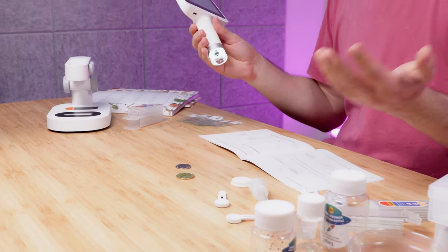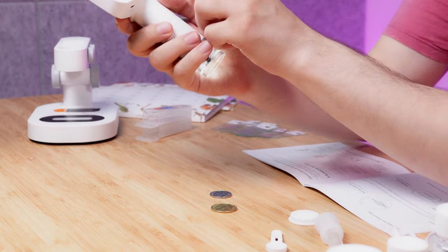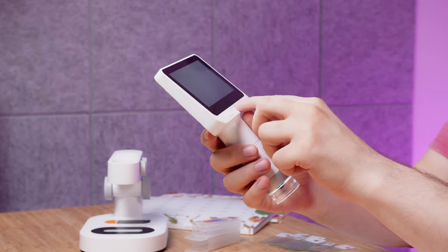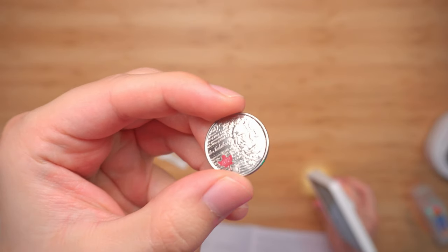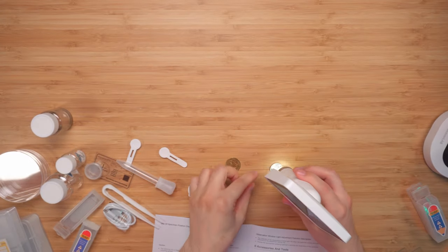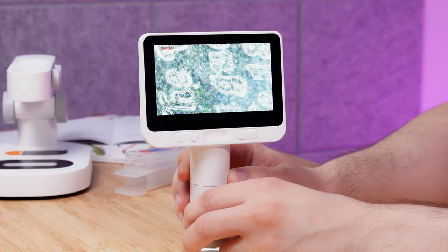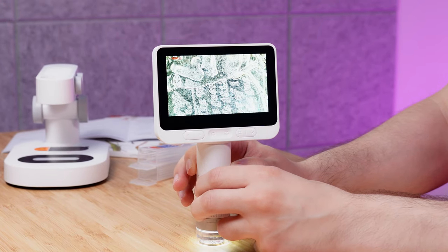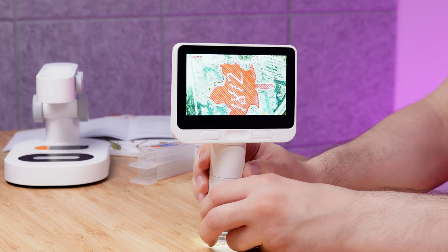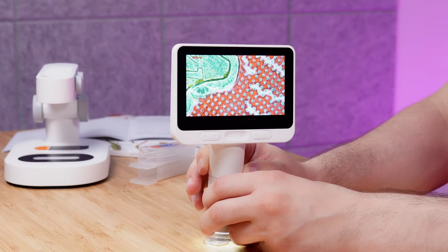Now let's take the microscope out from the base and do a few things. First I have some coins to see what detail we get. I'll hit record so everything you're seeing comes directly from the microscope. Put the coin under and you can definitely see some nice detail you're not really able to pick up with your eyes — and even zoomed out you can see all the scratches.